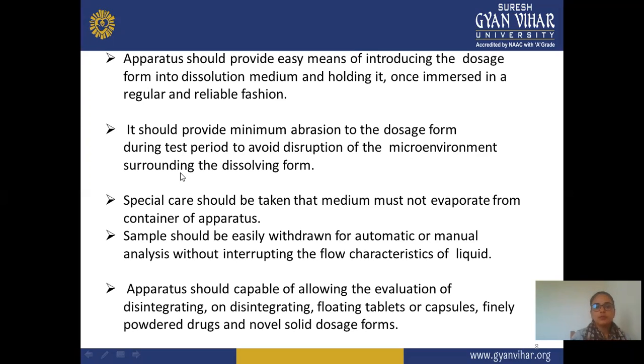And next, samples should be easily withdrawn for automatic or manual analysis. Means you can easily withdraw your sample with the help of a manual or analytical procedure, without interrupting the flow characteristics of the liquid. Means the flow characteristics of your formulation or liquid are not affected, and it is easily withdrawn with the help of a manual or automatic analysis technique.